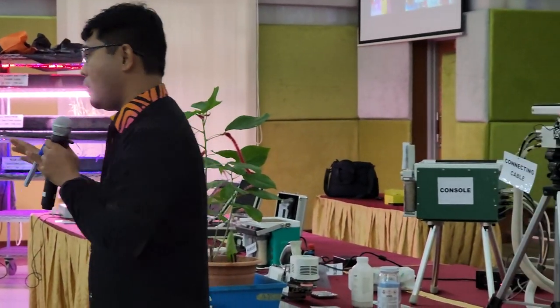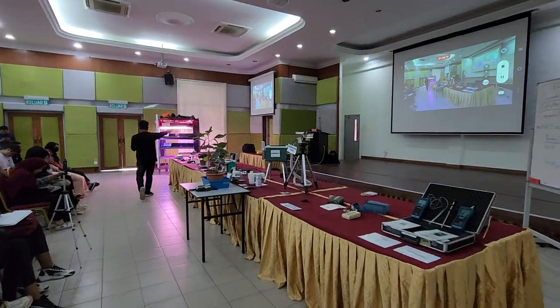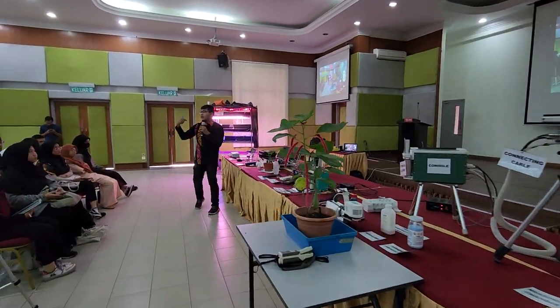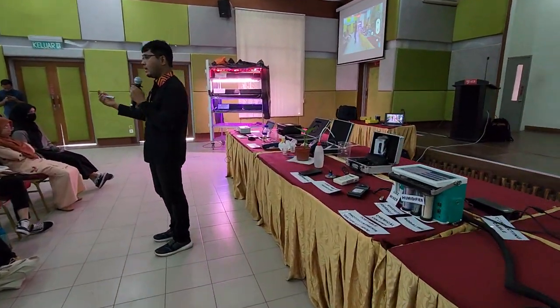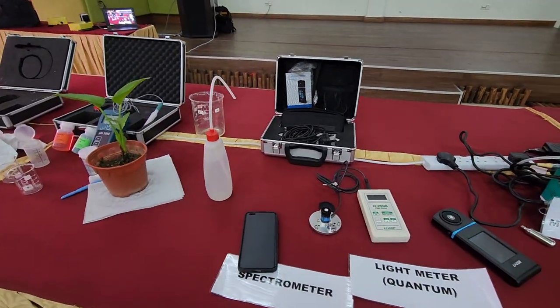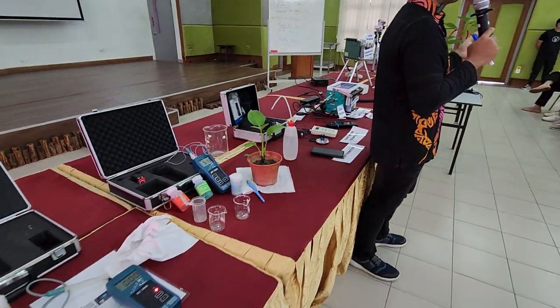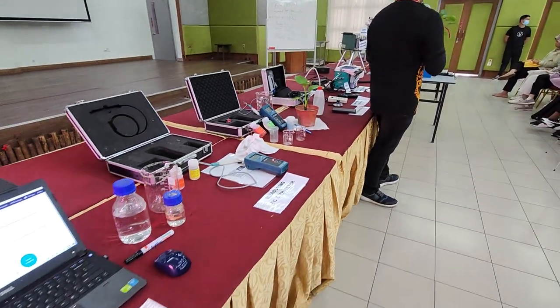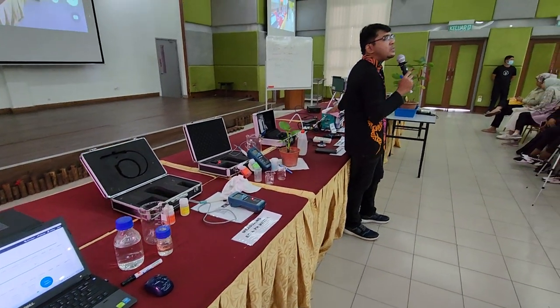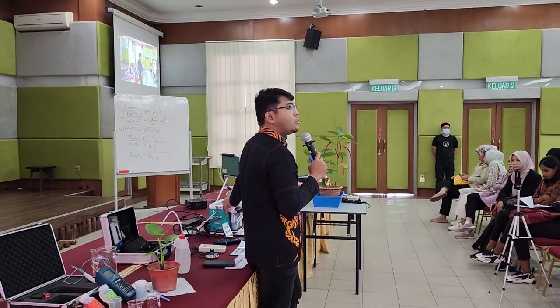All right, okay. I think that's all for the demonstration up to this point. So, just a quick recap. I have introduced to you various equipment to quantify environmental growth conditions for the plants: the gas, the water, the pH, the light. Okay, and then after all of this you have understood what happened to the plant at the physiological level, the photosynthesis of it. So we use this machine. What is the Calvin cycle speed like? If you think about it, this is kind of measuring Calvin cycle speed. The faster it is, the more sugar you're going to get.